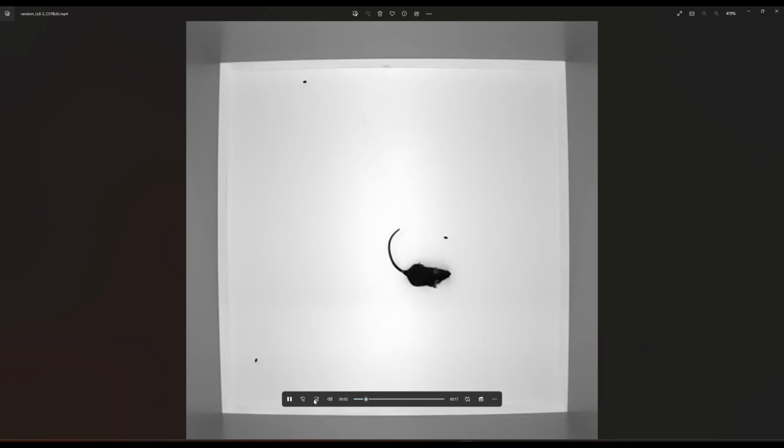This is a representational video from the top-down view. If I was to do this gait analysis for real, for a lab experiment or for some kind of project, I would want to capture the mice from the bottom perspective to capture their paws. Now from the top down, we can still use the shoulders and the hips as a reference point for where the paws should be. And as those hips are going to move along and shoulders are going to move along, we can use that as a reference point. But it's not accurate, so therefore don't assume accuracy in this YouTube video session.